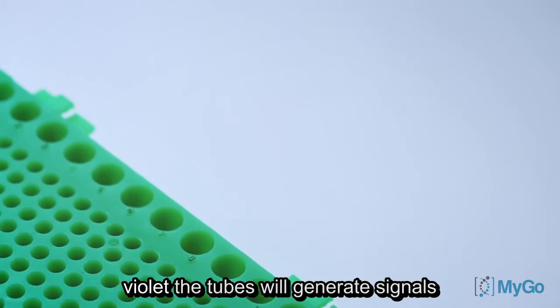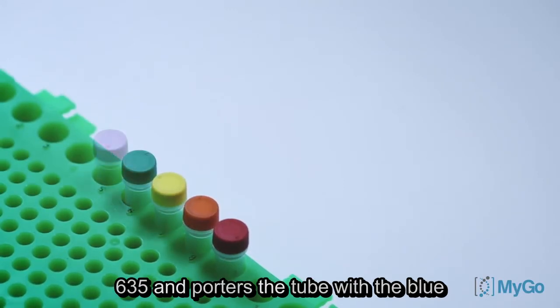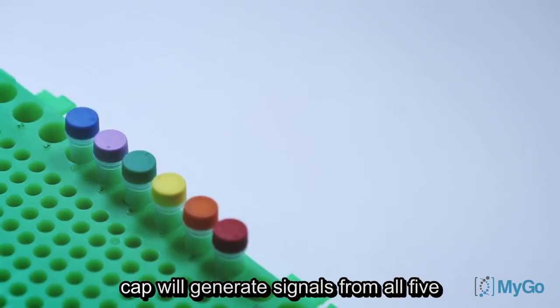The DNA tubes will generate signals from different fluorescent reporters that the MIGO Pro will discriminate between. From red to violet, the tubes will generate signals from FAM, CAL540, CAL560, CAL610 or CAL635 reporters. The tube with the blue cap will generate signals from all five reporters.